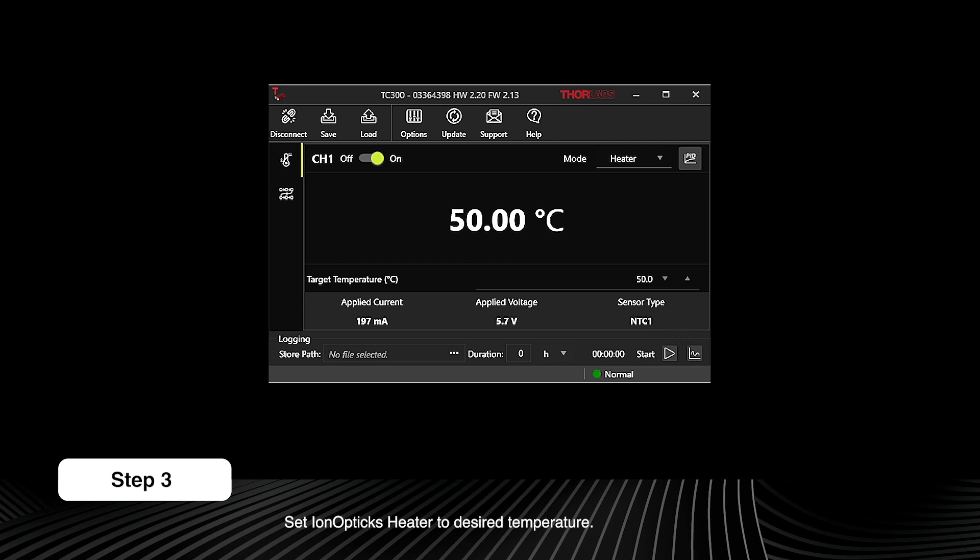We recommend using a temperature between 40 and 60 degrees Celsius. The maximum recommended temperature is 60 degrees.